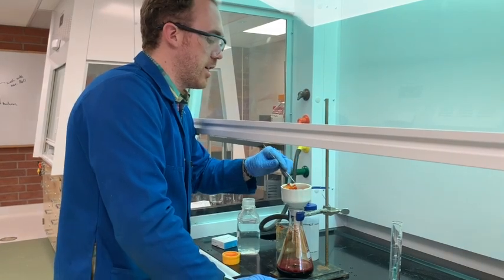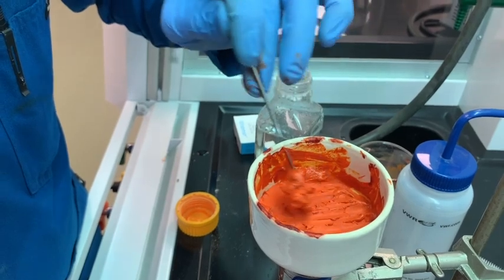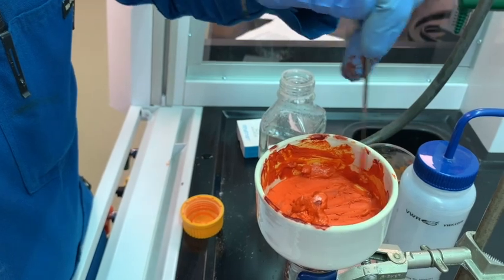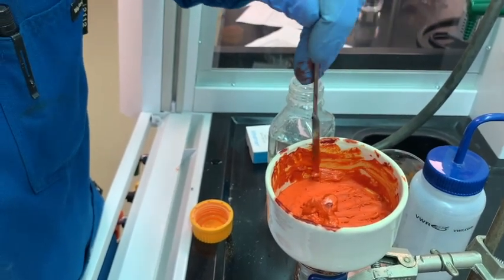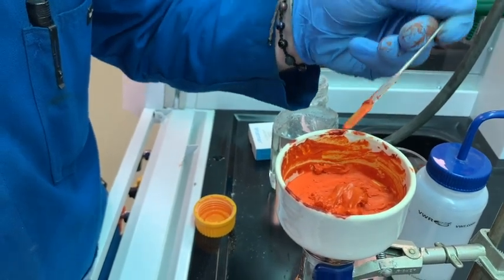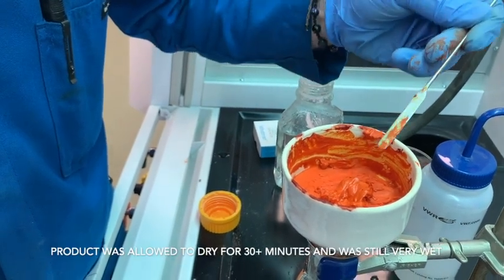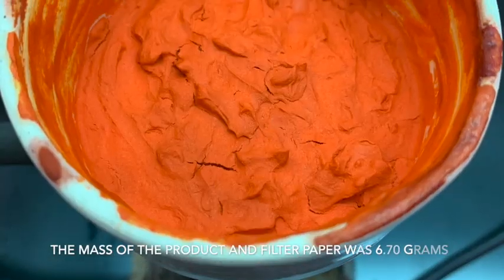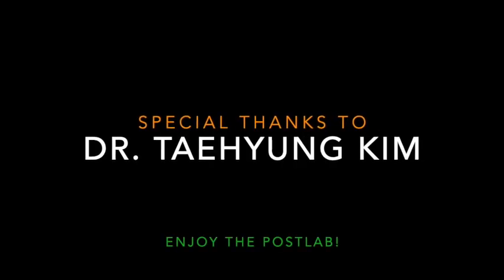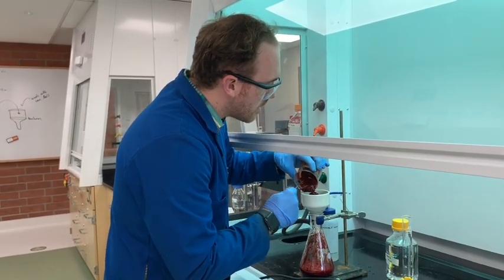And take a look at how chunky it is in there. Still need another recrystallization, but it appears to be the product that we want. So we succeeded in that end. Not very crystalline, more like a paint. I'm gonna go paint a masterpiece. A very orange masterpiece. That is some funky stuff.